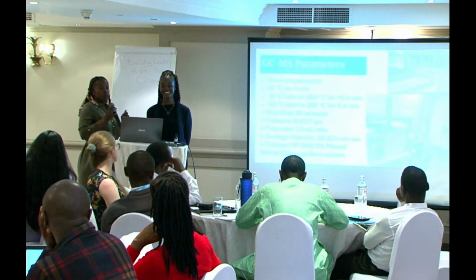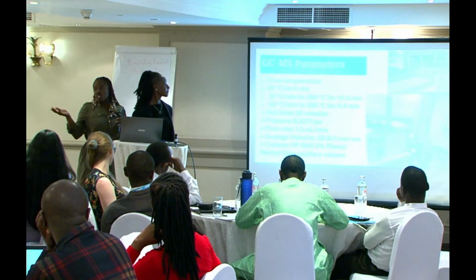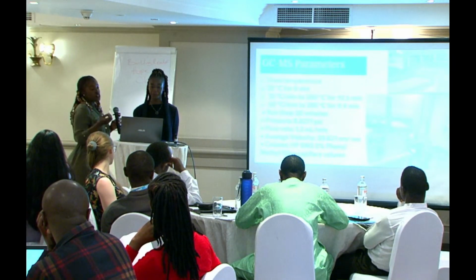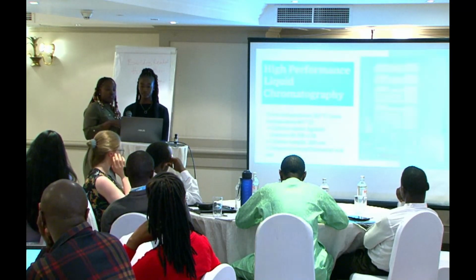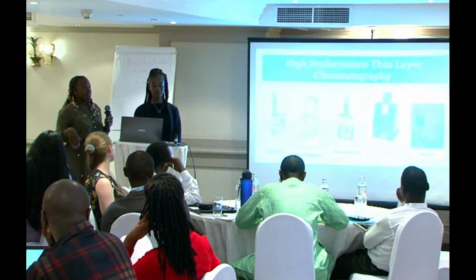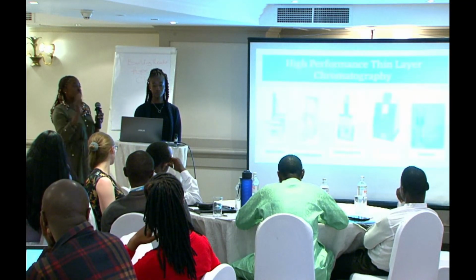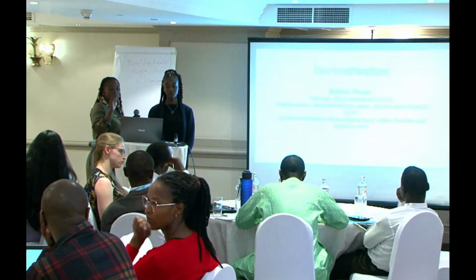The gas chromatography followed by the mass spec parameters. These were some of the things that were shared amongst all of us, with the temperature regulations and pressure as well. And then the HPLC was performed, following those same methodologies. And then the HPTLC, which I think was so kind to share with us, which we followed these instructions.